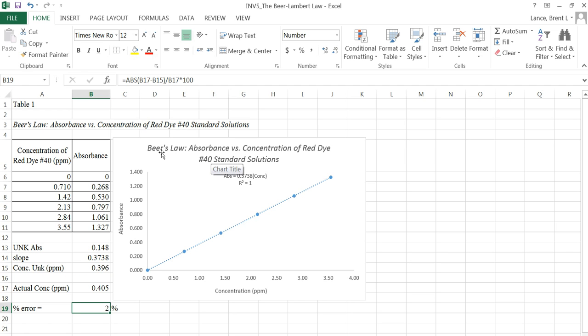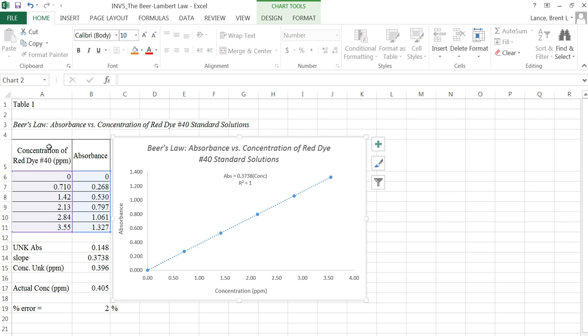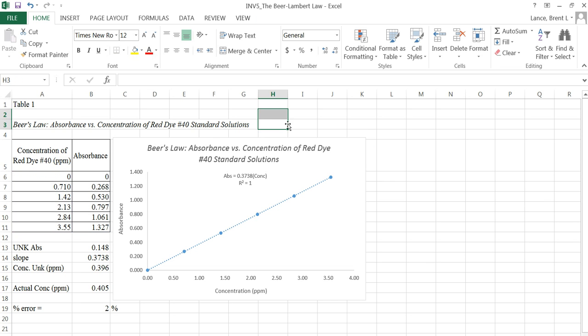So part of this, I'll show you in another video how to, once you've made this, insert this information into your lab report in the data in the results section. So anyway, this will get you to be able to format your graph the way that I'd like to see it, and then from there we'll talk about putting it into your lab report.